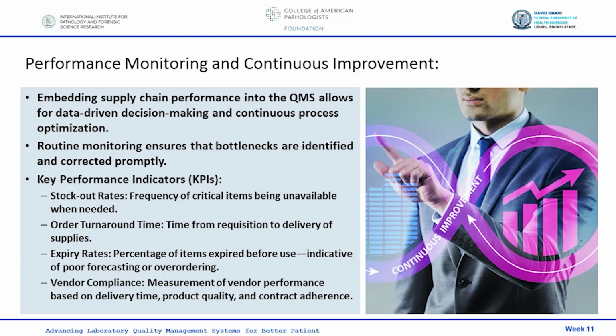It doesn't end at it being logged. Okay, sorry about that. Yes, you don't end at it being logged. You still have to investigate and make corrections. Audit results should be fed into periodic management review meetings. That is very important too.